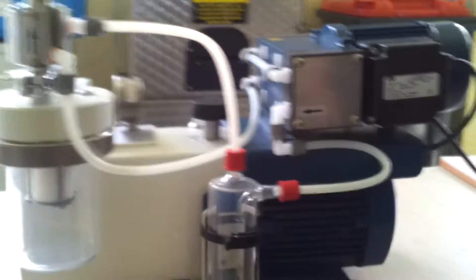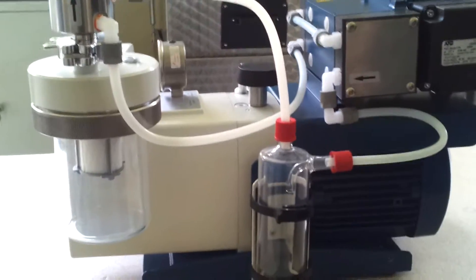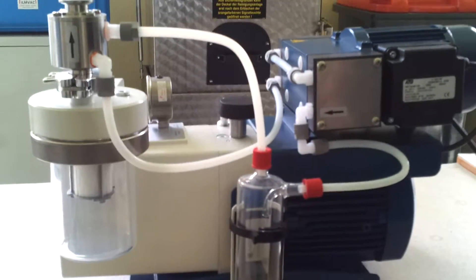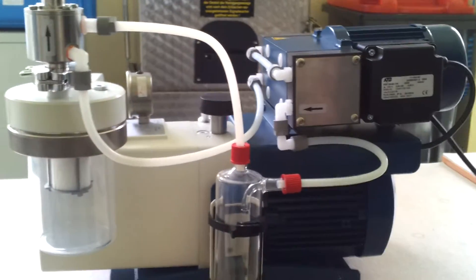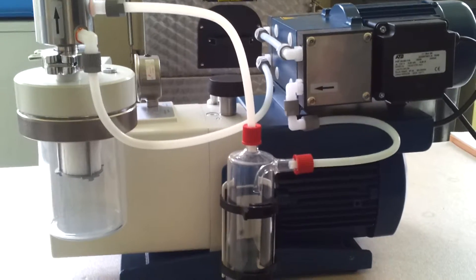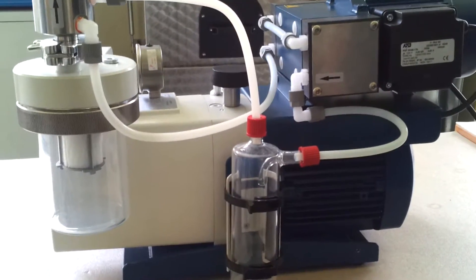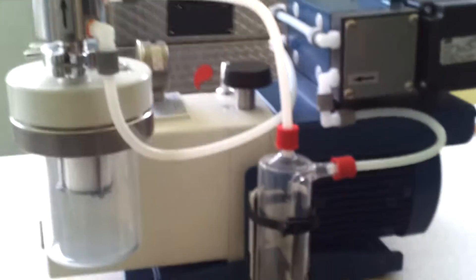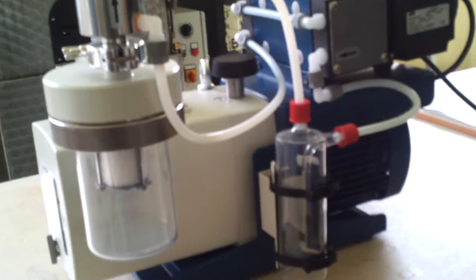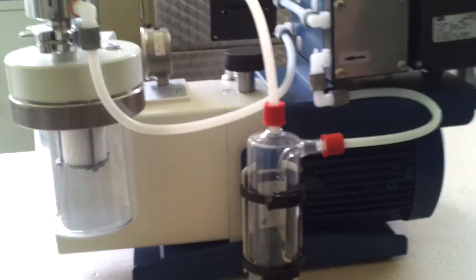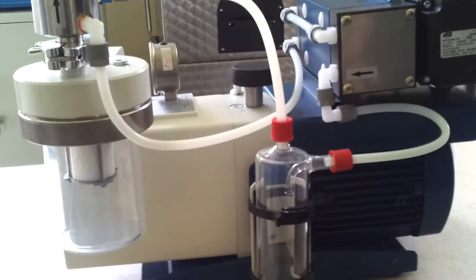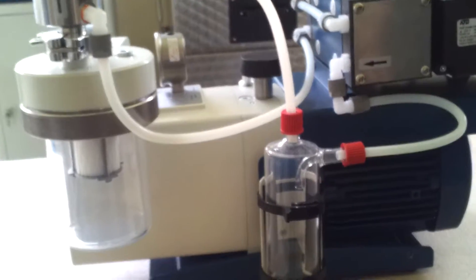We are now viewing the ChemVac system, an addition of a diaphragm system to a rotary vane vacuum pump. The aim of this system is degassing the oil to avoid contamination.